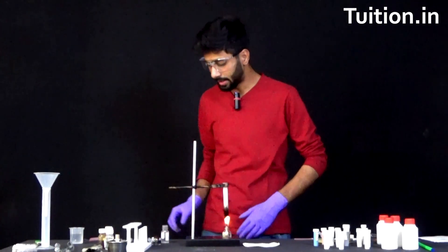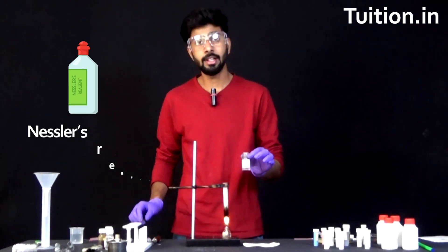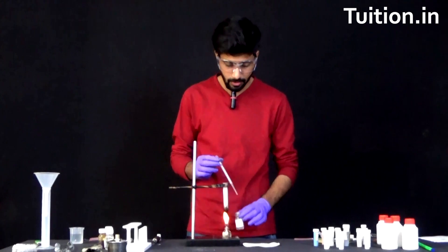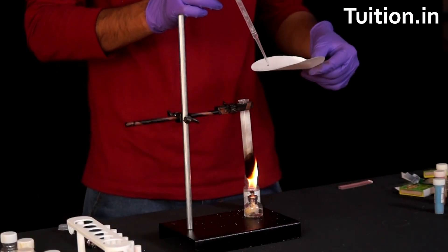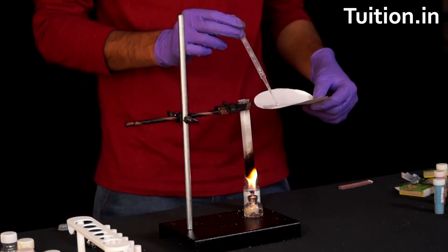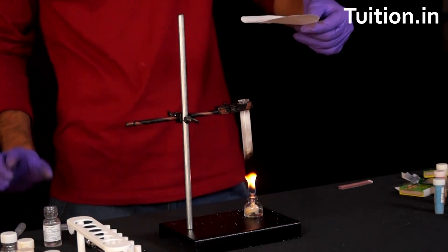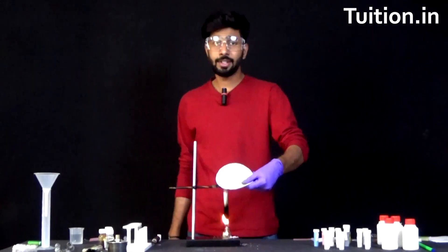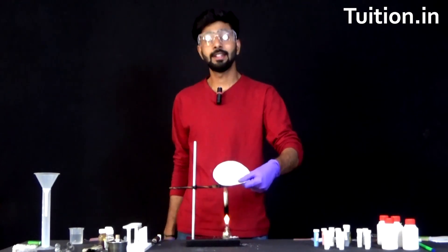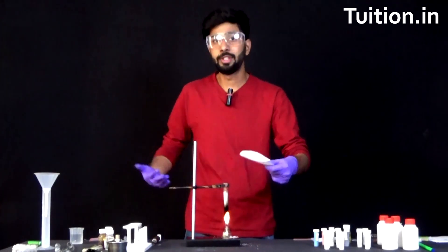Now it's time for us to check what else is present. We will be taking what is known as Nessler's reagent, with chemical formula K2HgI4, and tip it onto a filter paper. It's a colorless reagent in the beginning. Let's place it at the mouth of the test tube. As you can see, the filter paper has slightly got a yellow color now. This is because Nessler's reagent has reacted with ammonia, which was coming out as the end product. And hence ammonia was detected.